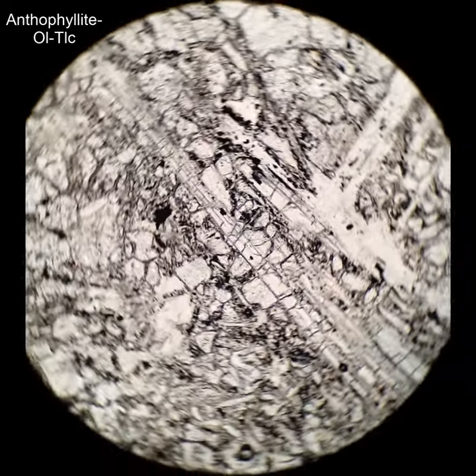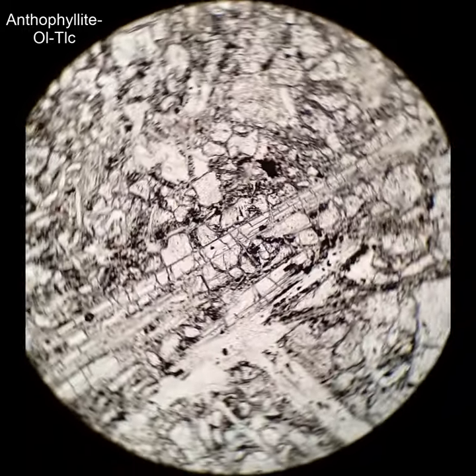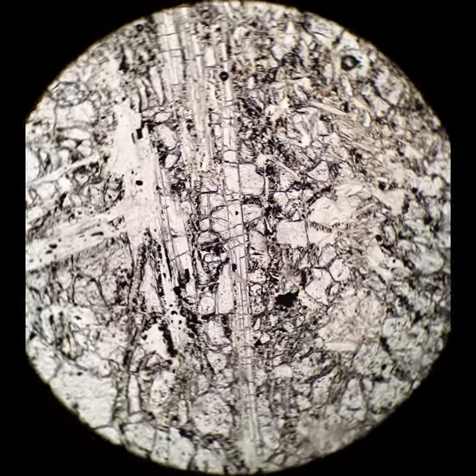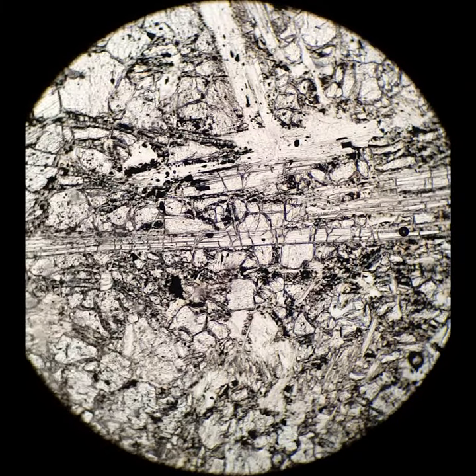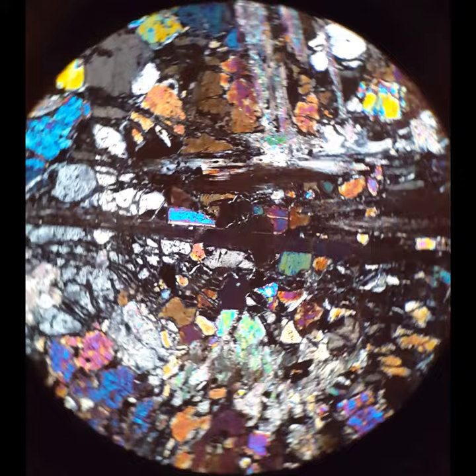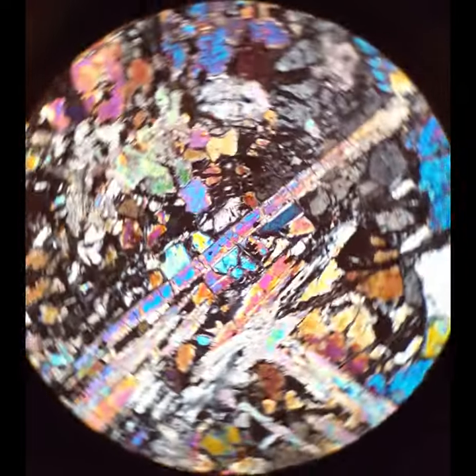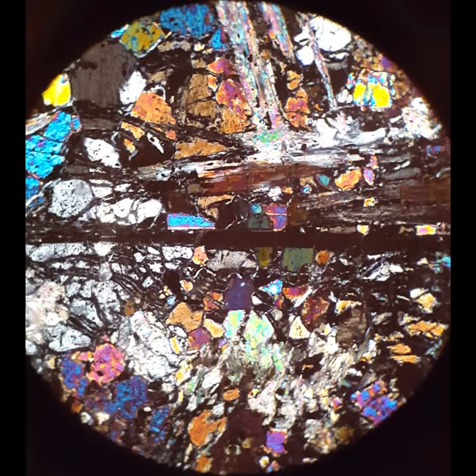But this one I'm sure is anthophyllite — it's that long skinny grain in the middle. You'll see it has parallel extinction, absolutely colorless in this case. And it coexists with talc and olivine. It's really that coexistence with talc and olivine that tells me it's got to be anthophyllite. Anthophyllite and talc are common in altered ultramafic rocks, and altered ultramafic rocks don't have very much sodium or aluminum in them, which would form gedrite. So context matters here.